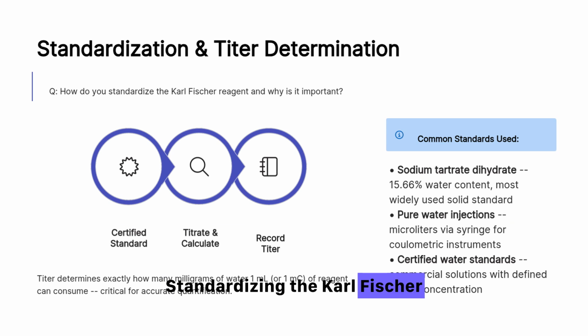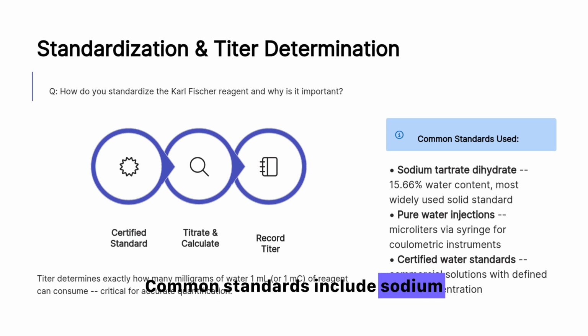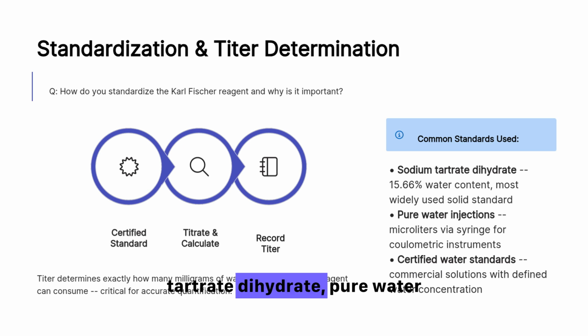Standardizing the Karl Fischer reagent is crucial for accurate water quantification. The titer indicates how much water 1 milliliter of reagent can consume. Common standards include sodium tartrate dihydrate, pure water injections, and certified water standards. Verify the titer daily or before each batch to ensure precision.